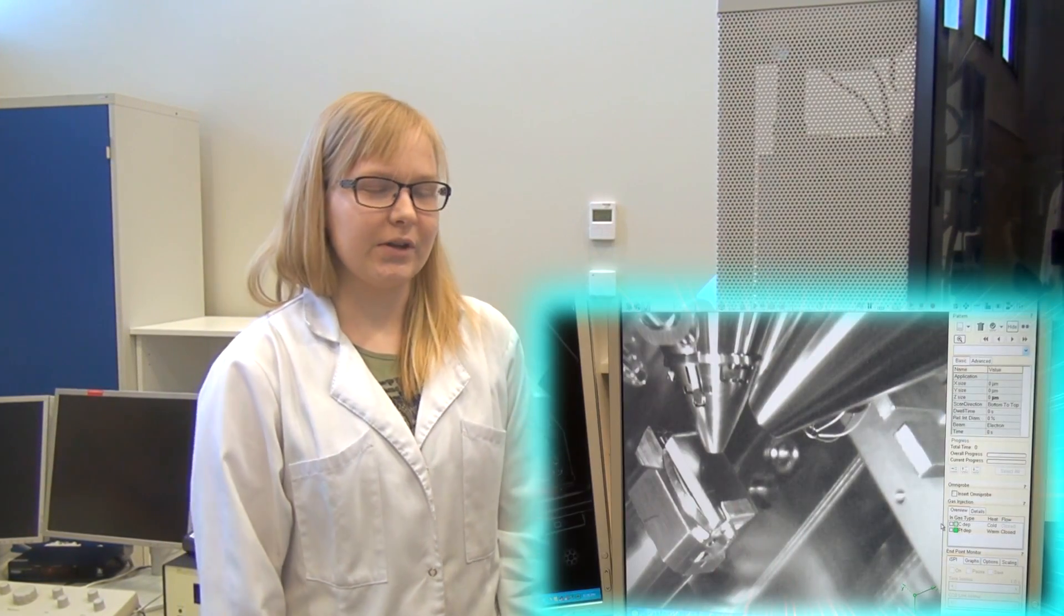In case you didn't know, the focused ion beam is created with this ion gun over here that is mounted to the scanning electron microscope. The other end of the ion gun is inside the microscope and aimed at the sample that we study. So, let us power up the ion gun and get started.